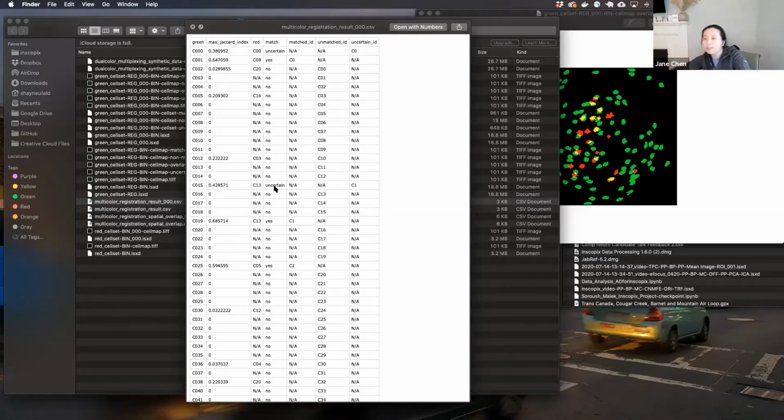So what if, in an extreme example, you have a complete 50% overlap in that case? Let's say my 2 purple cells are square, and then you have that red square that's in the middle. I mean, it's just going to come down to the math, right? If it's exactly the same, then it's going to fail. It's probably going to be any slight difference, then it's going to go with the maximum one. Okay. Good question. Any other questions here? This is it for multicolor registration.